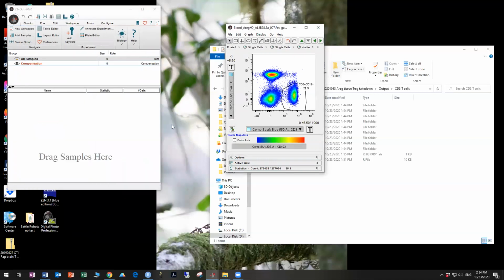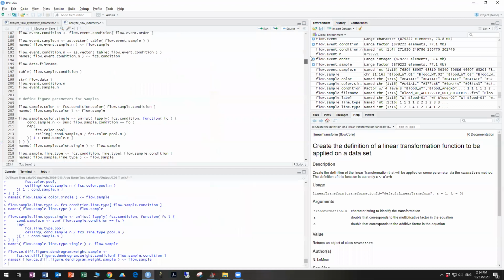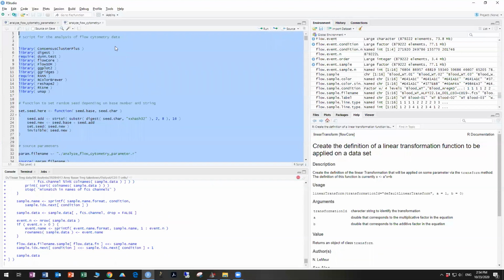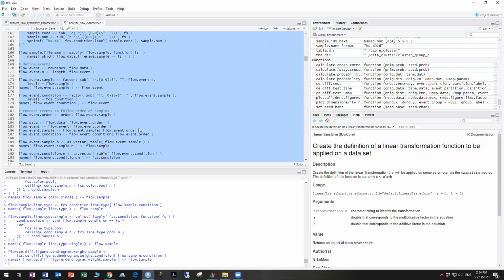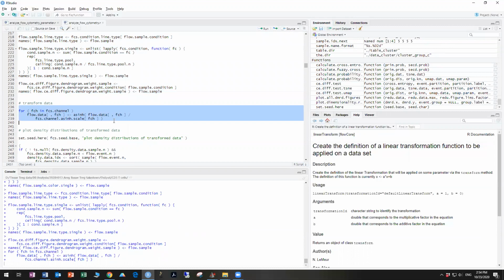Right. So we're going to go into R and take up from where we left off. If you aren't certain where we left off, you can always go back to the beginning of your analysis script and start over from the very beginning by running Control-Enter. And that will take a moment, but you'll get to the same point in the end. All right, so now we're going to start by transforming the data where it says hashtag transform on line 235. So select this, and again, Command-Enter.